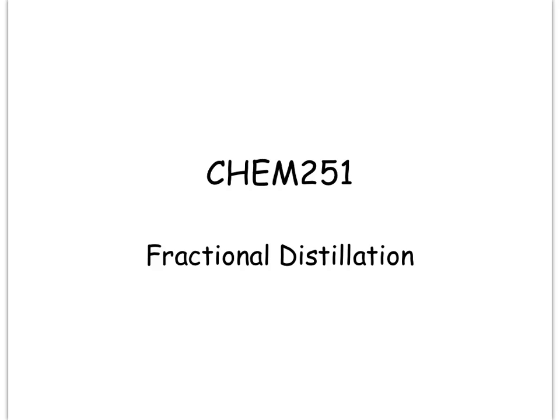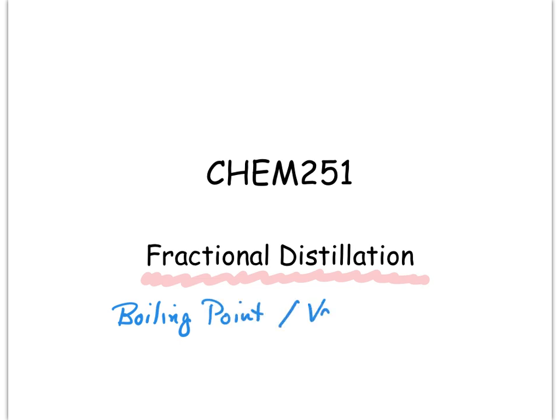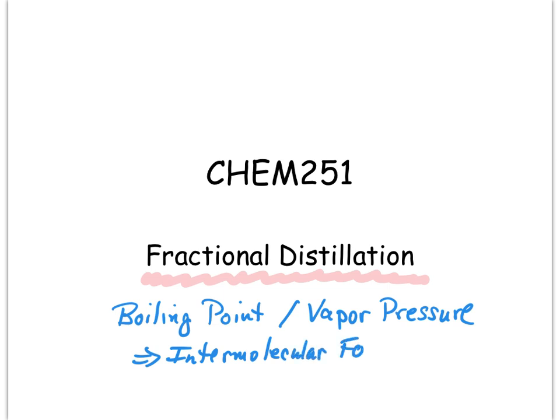In this week's laboratory, we're going to work on a separation technique, fractional distillation. We're going to separate materials based on a combination of boiling point and vapor pressure, which we know are related because they're both affected by the kinds of intermolecular forces between molecules.